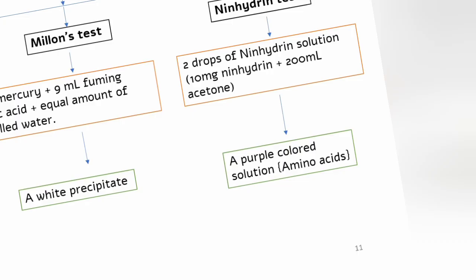Biuret test consists of Biuret reagent, which consists of 2% copper sulfate, besides 1 milliliter of 95% ethanol and potassium hydroxide base. Biuret reagent gives a pink colored solution in the ethanolic layer of plant extracts if they contain proteins and amino acids.